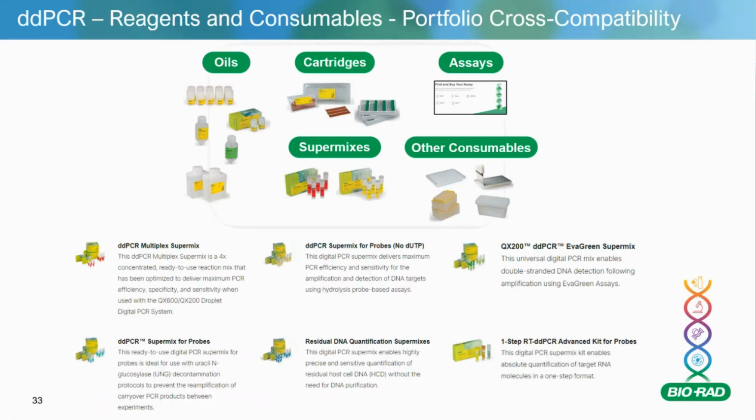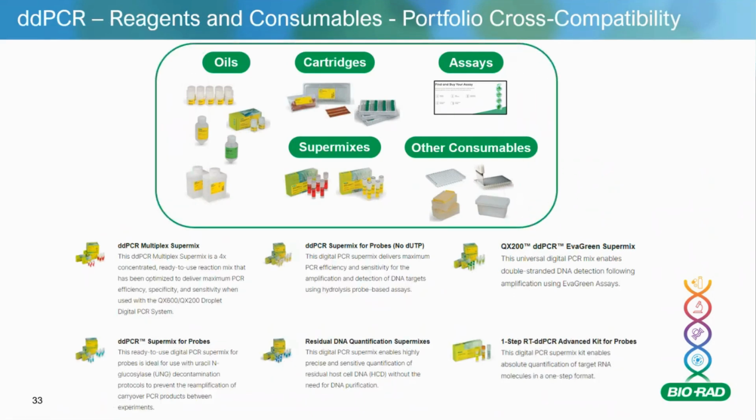So those were just some of the examples of pathogen monitoring and detection. As you can see, ddPCR really offers those benefits of the absolute quantification method, so not having to use any standard curves, not having to have standards included, which is obviously very expensive, very time consuming, and difficult to run in triplex. There's also the benefits of a much higher inhibitor tolerance and a much higher sensitivity.